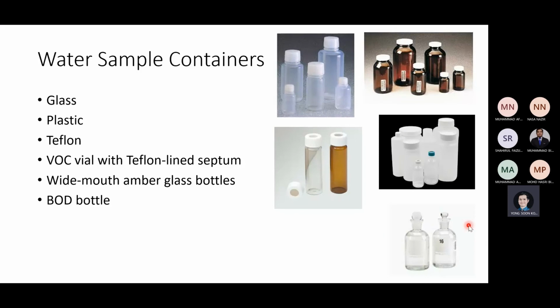Remember the weighted bottle sampler. Yeah, you need this. Either, these are the reagent bottles. This one you have a stopper. The other one you may have like a screw cap. You have a cap. A lot of things that you can use.